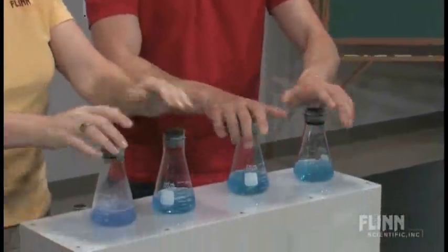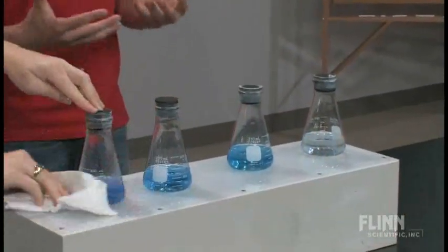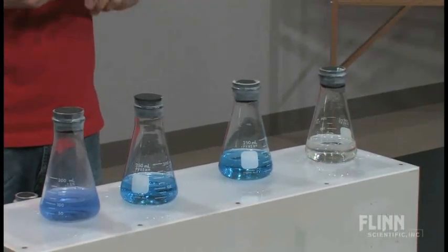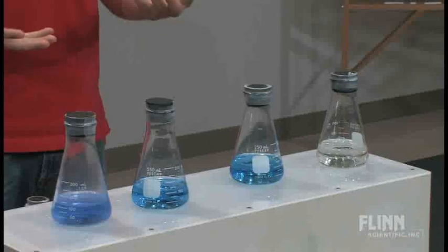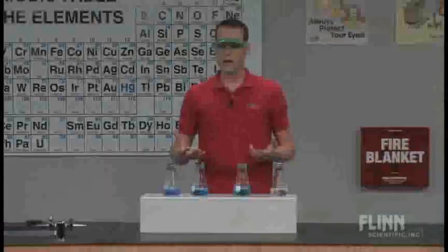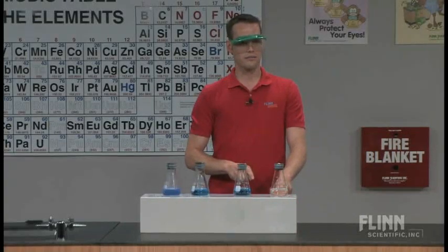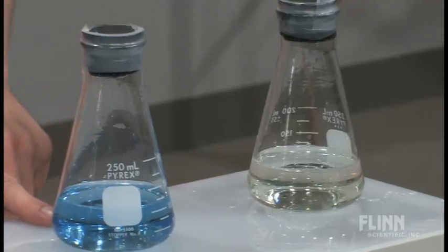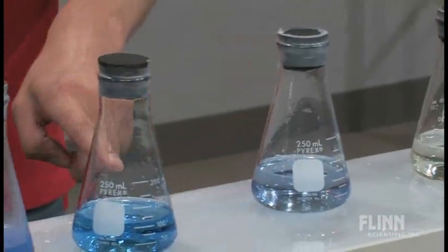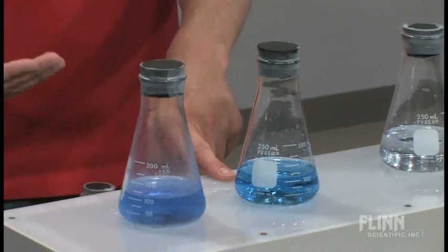Now, one of the neat things about this reaction is right off the bat, you see a color change happening out of nothing. You just shook it. You didn't add any compounds. And all of a sudden, you noticed a color change out of nowhere. That's a pretty brilliant thing for a student to see the first time. But then the next thing we start to look at, this one's already turned back. This one's starting to fade. And then on down the line, we get more and more fading over time.